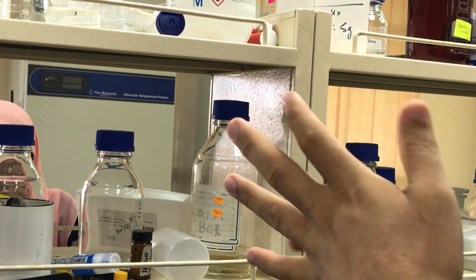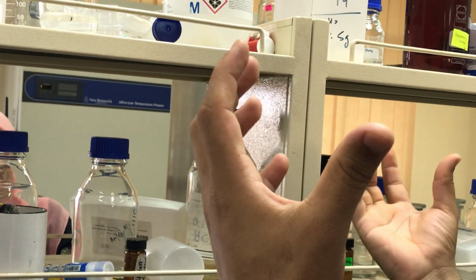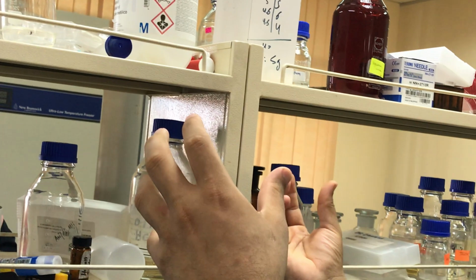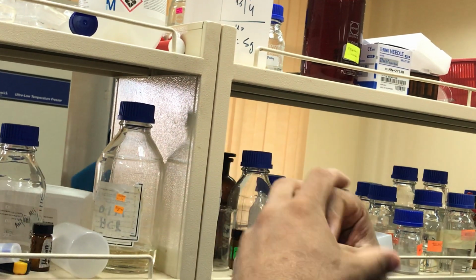You can see from less polar to high polar, all are showing activity, because we use ethanol, which is less polar compared to water. Among all these extracts, all were showing high activity.